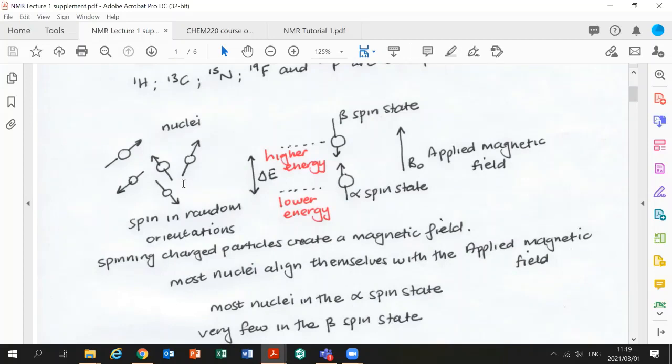So we're going to send a pulse of radio frequency radiation such that you have enough energy to say, let me stop spinning from left to right. I can now spin from right to left because I want to spin in the other direction, not being aligned with the magnetic field. And you're allowed to do so because the nuclei that we're dealing with have two spin states. I can either spin in one direction plus half or the other direction minus a half.